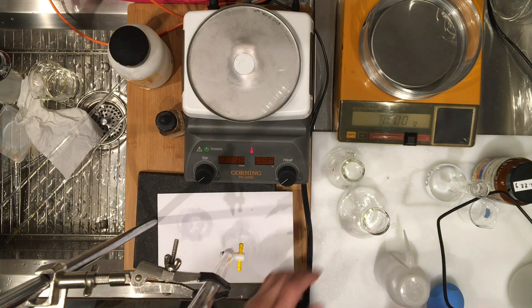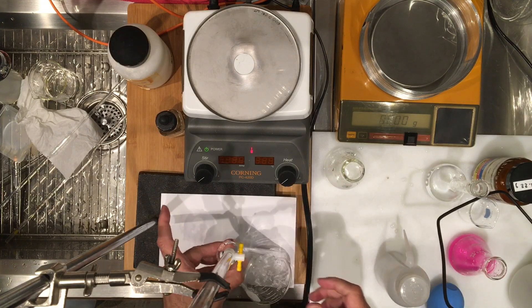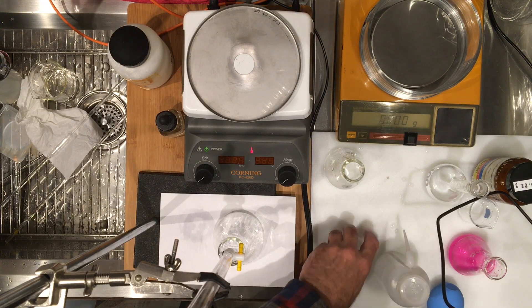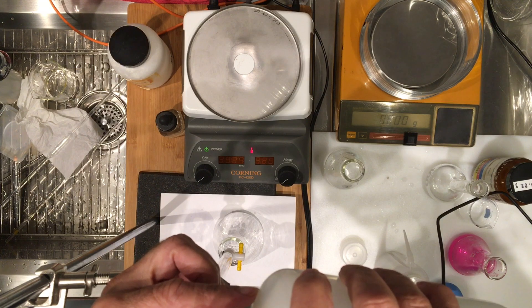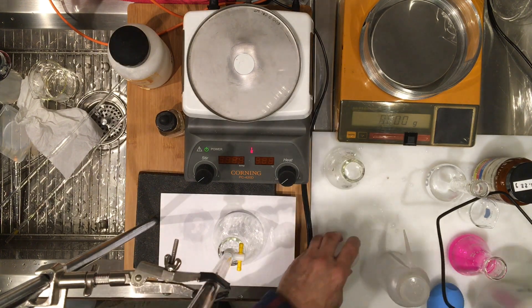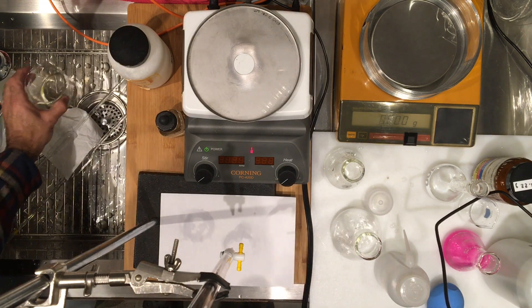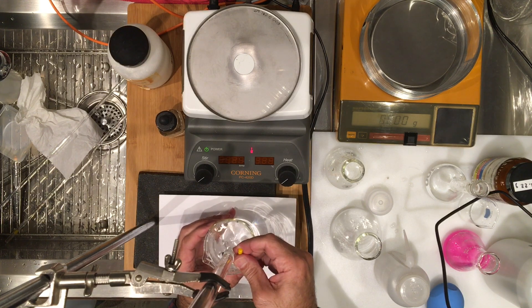Now we are ready to do our second titration. We're going to be filling the burette back up with sodium hydroxide, so I'm going to be very careful — without talking while I do this. There's my sodium hydroxide. Before I start the titration I have to make sure the level, the volume, is at zero zero.